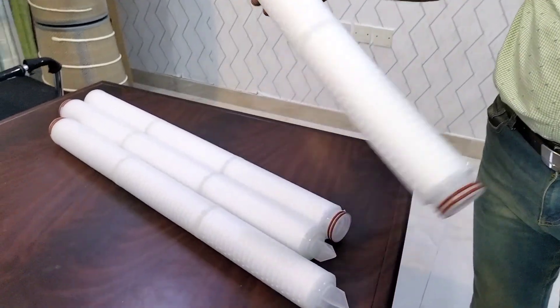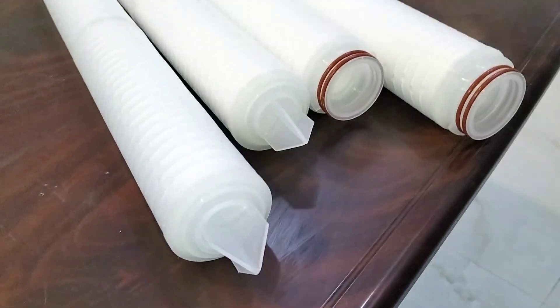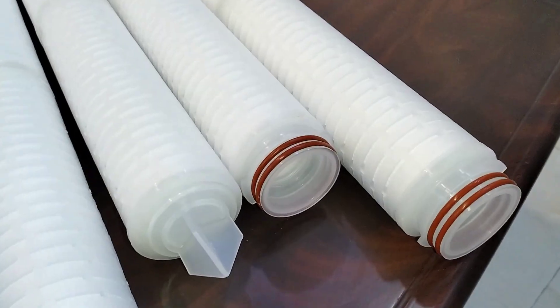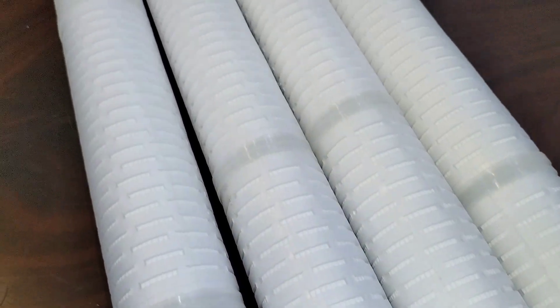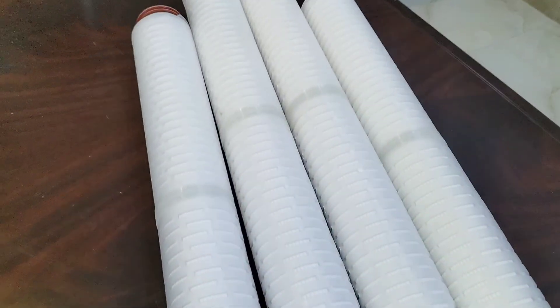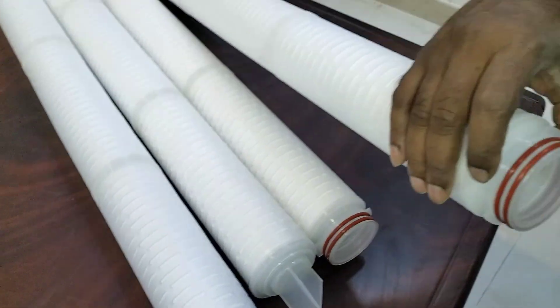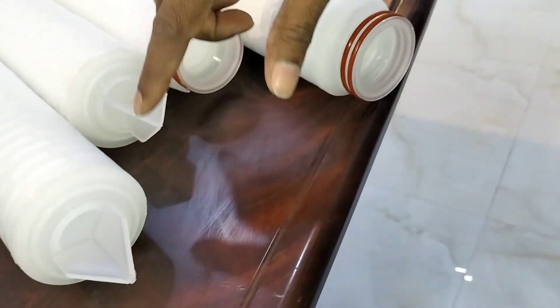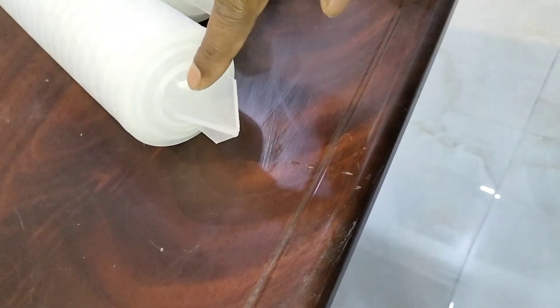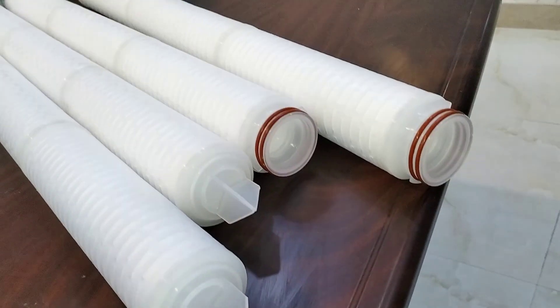This is showing the 30-inch size — we also have 10-inch, 20, 30, and 40-inch sizes. The connection size is for the triple-222 with fin. We connect the triple-222 with a twist lock for the inlet connection, and the end is a fin connection for the closed area where we connect from the filter on the inside of the housing.